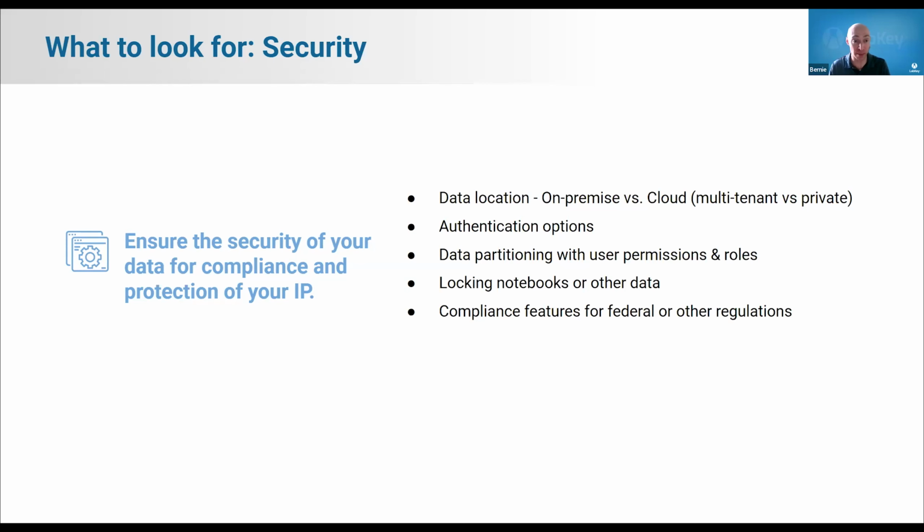Relatedly, you may need the ability to lock down data, lock down notebooks and other data. This certainly falls under security and is often needed because of the next point on here, which is the need to comply with various federal, institutional, or other regulations that may dictate some of your choices here.